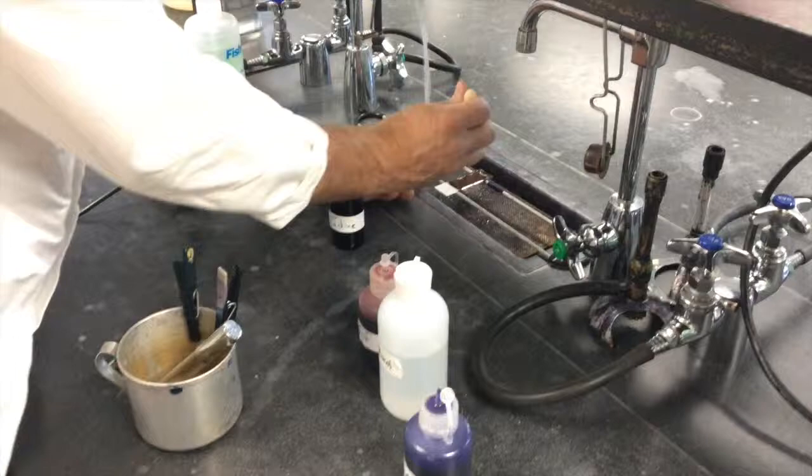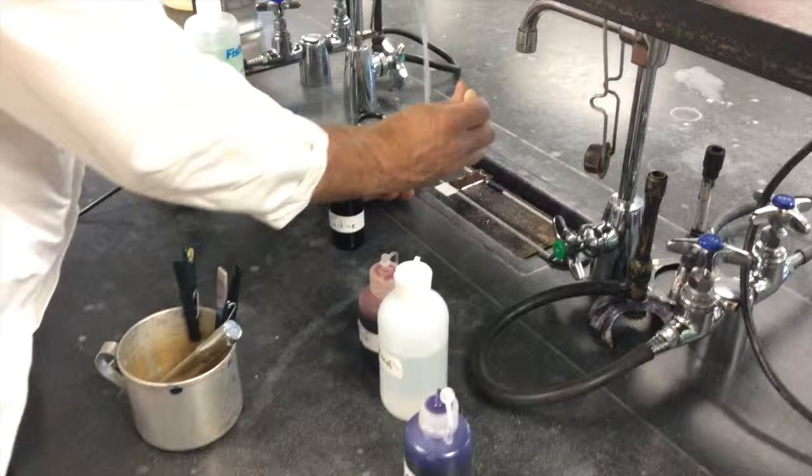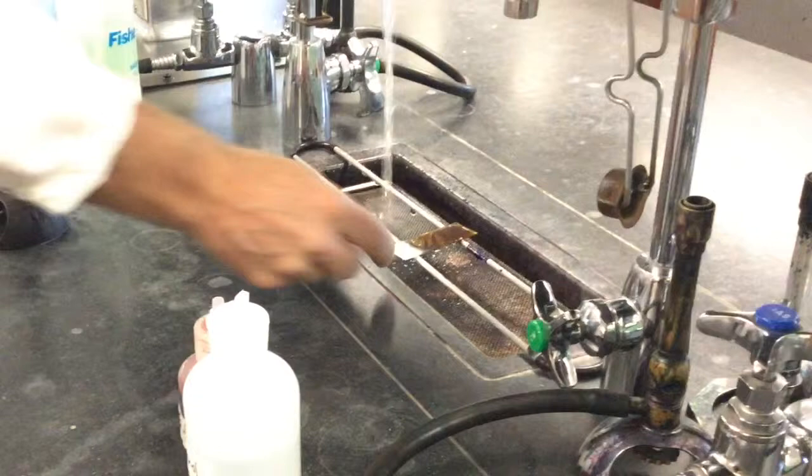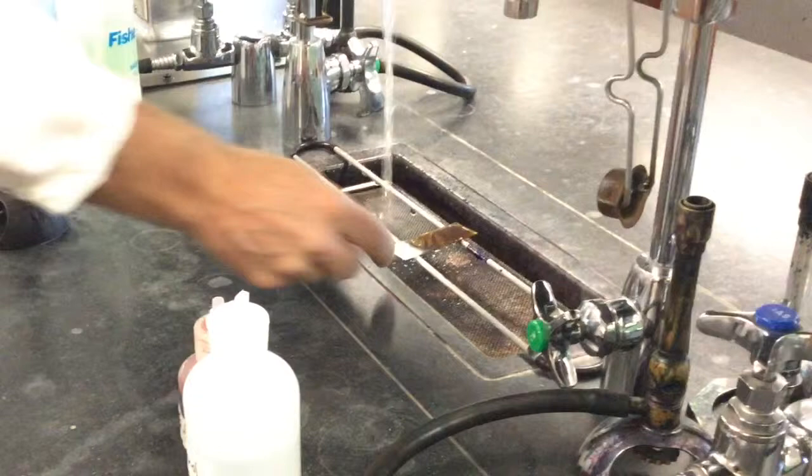So now you want to add iodine. Again, just flood the slide. You can actually sort of flood off the crystal violet with the iodine. But just let it sit for another minute. And that basically is complexing with the crystal violet within the cell walls so that it's harder for it to decolorize with the decolorization step. So it's been a minute.